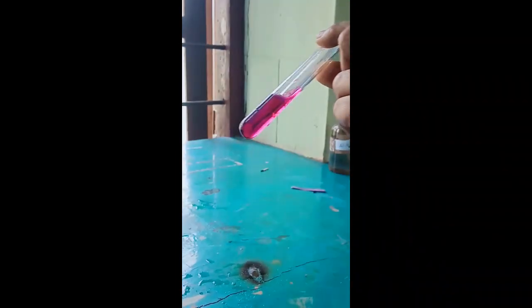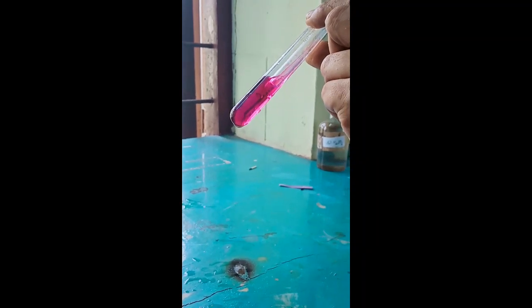Sulfur dioxide is a colorless gas which is produced during this chemical reaction, and this is the test for the acidic gas sulfur dioxide. On passing the colorless sulfur dioxide gas through acidified potassium permanganate solution, this is acidified potassium permanganate solution, and the color of the solution is purple. On passing the gas through it, the color vanishes. So the pink or purple color of KMnO4 vanishes.